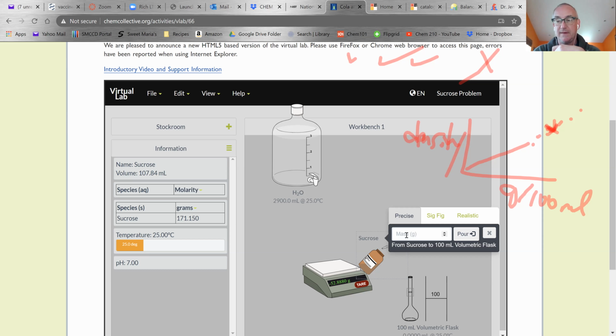Yes or no? Can I use this density measurement to determine concentration? It's outside my standards. What do you think? Don't be afraid. Put the slope level out.